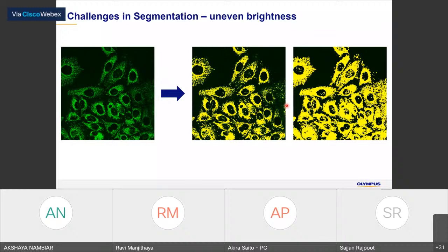If you include this area and put the intensity threshold a little bit lower, then the other mitochondria detections become bigger, and it might be difficult to identify single mitochondria.